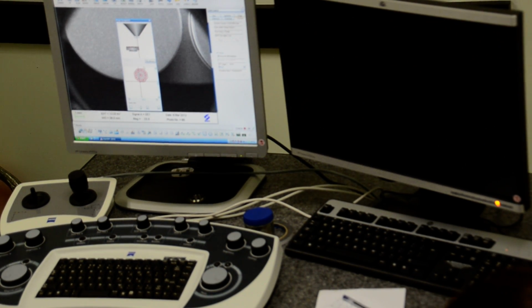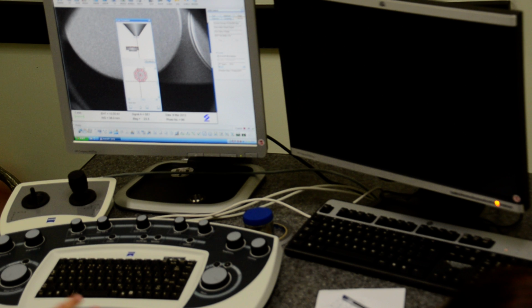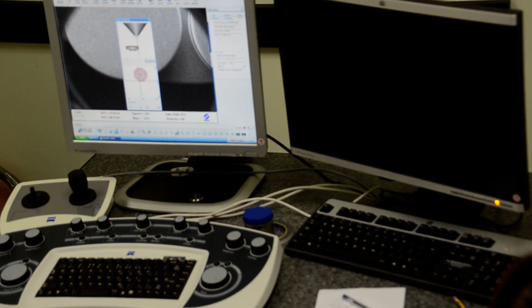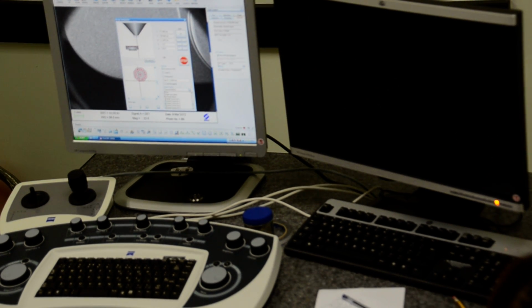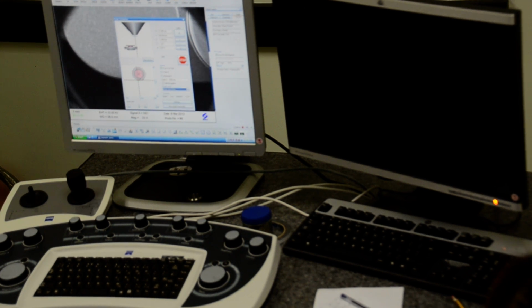So that's why just now I said that when you put the sample, you have to let the horizontal one align with the stage. Otherwise, you will mess up the... Okay. Yeah. So this is a 9-stub sample holder. You can have different types of sample holder. This single one.